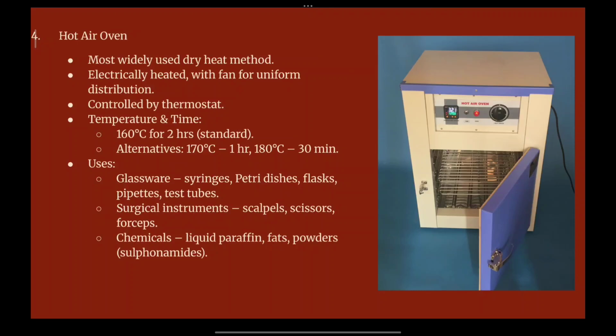So it can depend upon the amount of material that is being placed or the amount of sterilization the culture media or any other material requires. Based upon the requirement, you can change the temperature and the time, that is, the duration of sterilization. The standard one says 160 degrees Celsius for 2 hours. You can mention this in your answers, and alternatively you can mention 170 degrees Celsius, but don't get confused. The standard method of representing the temperature and time for a hot air oven is 160 degrees Celsius for 2 hours.